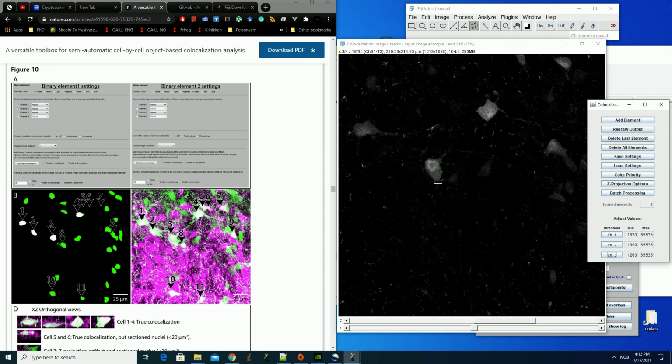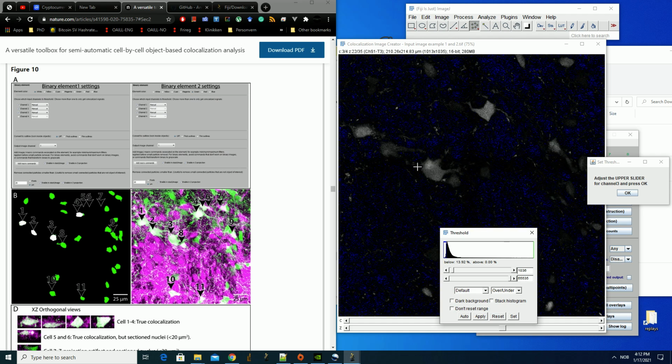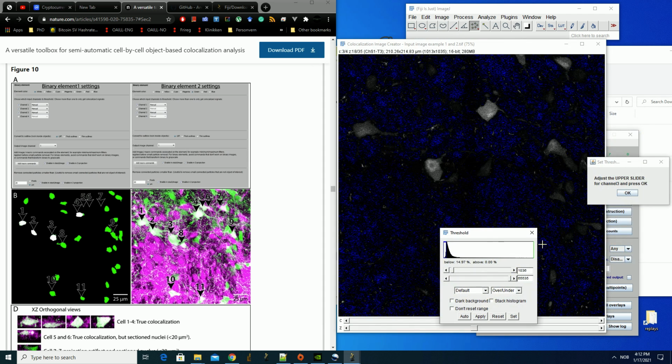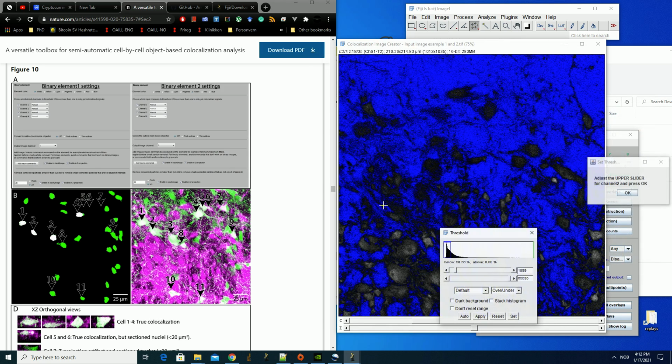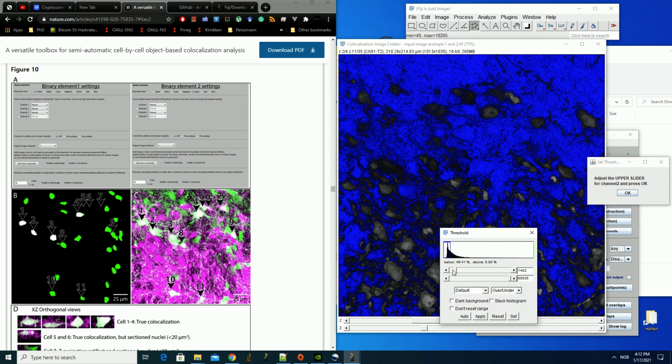What we saw here was that this cell that is output in the original example was not really included. So then we can change the threshold. Maybe it's this cell here, so it seems to be okay for this channel number 3. Maybe the issue lies in channel that was a bit low, it appears. Maybe the issue lies in channel number 2. This has a weak signal here, perhaps. I put it a bit lower.